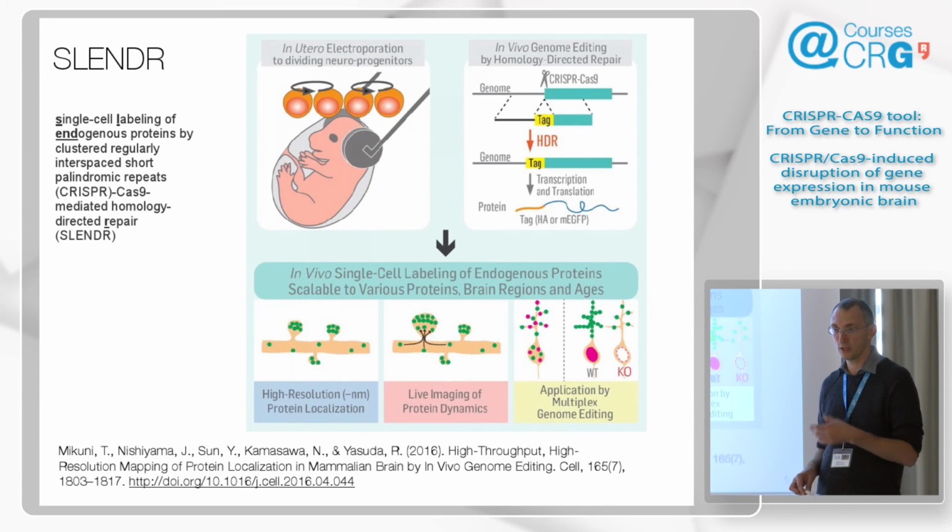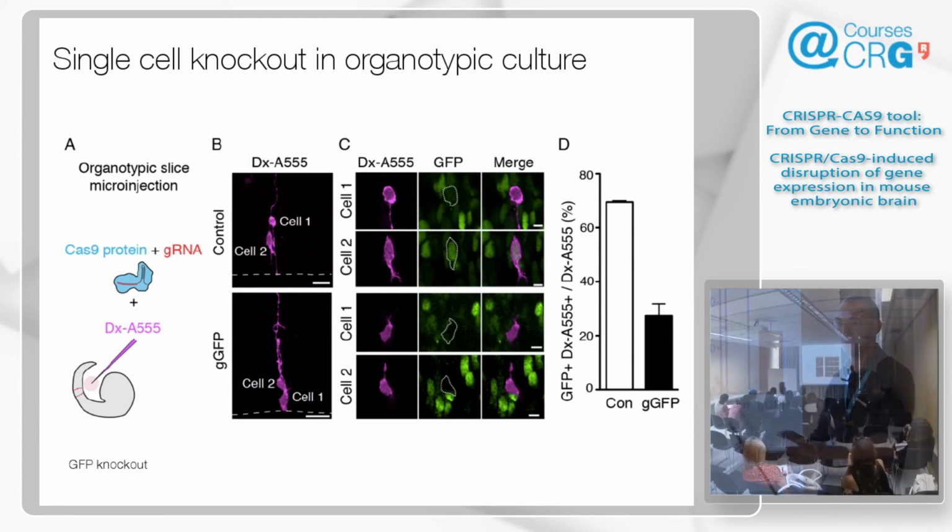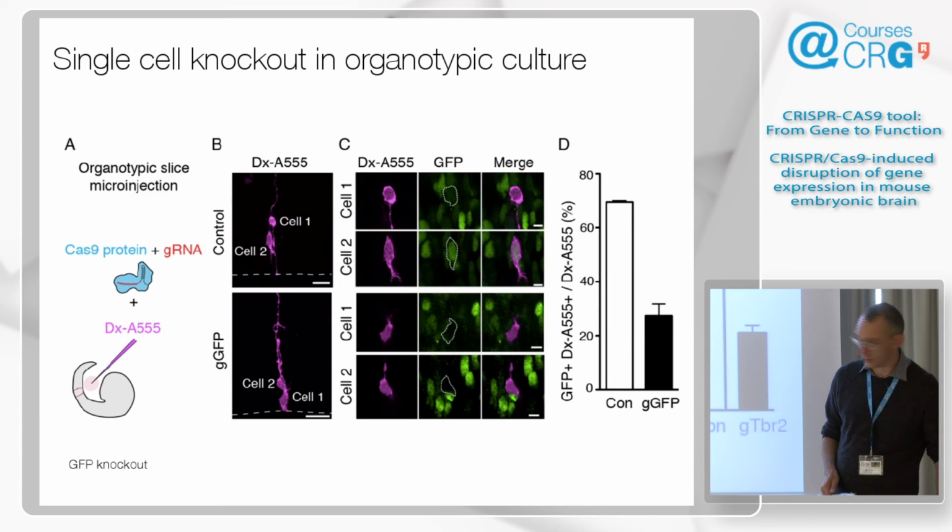And then they either do staining or they do localization. Because it's not very efficient, it's not every cell. And when you have one cell out of hundreds, you see the cell nicely isolated. There is not really an example, but if you imagine, it will look something like this: a single labeled cell on a black background. This is beautiful, because if you have transgenic mice where all the cells are expressing, you can't see anything in the mess. Then you need something like Brainbow, if you're familiar with this technique, to be able to segment the cells, and then a lot of image processing to identify the individual ones.